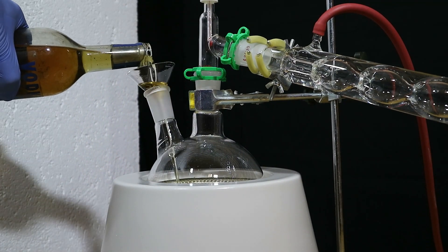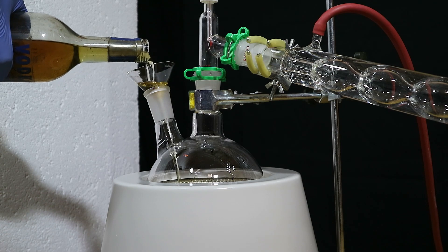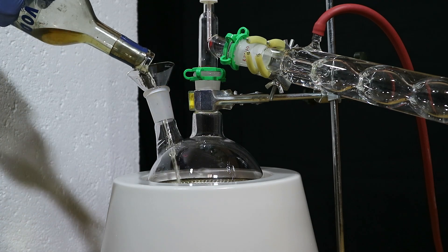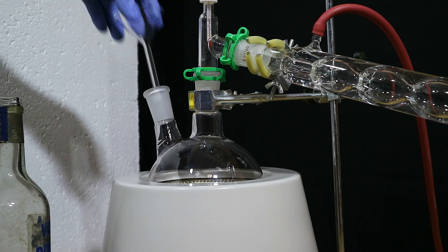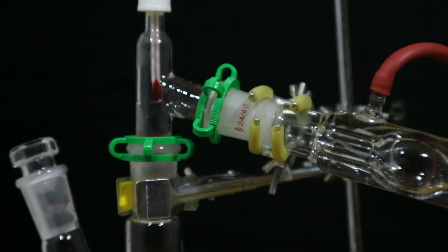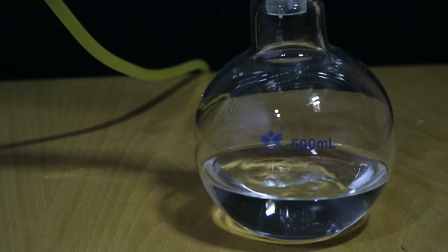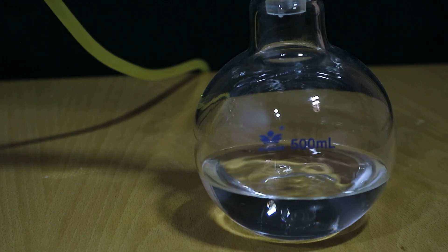The first distillation we're going to do without a fractionating column since we are mainly concerned with removing the heavy organic molecules that add the color and a lot of the aroma that I can sense and you can't. Even without the column this will still increase the concentration of ethanol significantly but we are not interested in measuring it or anything like that yet.